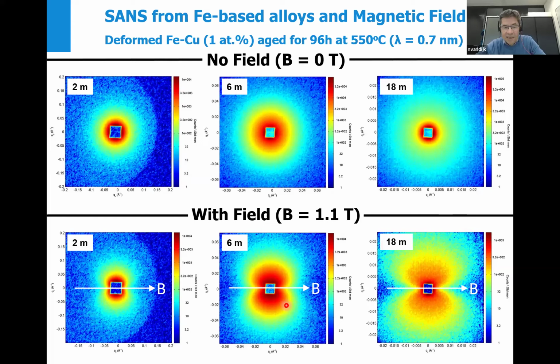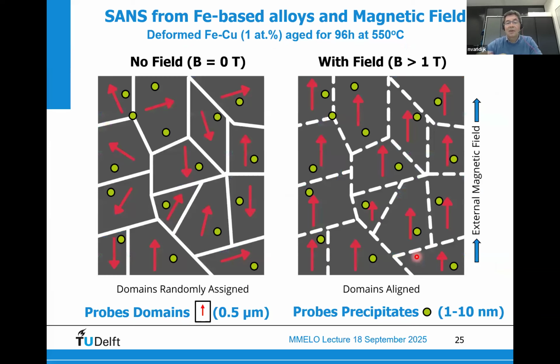You clearly see this sort of 8-shaped scattering pattern that is originating from the magnetic scattering, as the magnetic scattering is absent along the magnetic field and maximum perpendicular to this field. Because you know that the nuclear scattering is isotropic and the magnetic scattering is anisotropic, you can now separate the two and learn something.